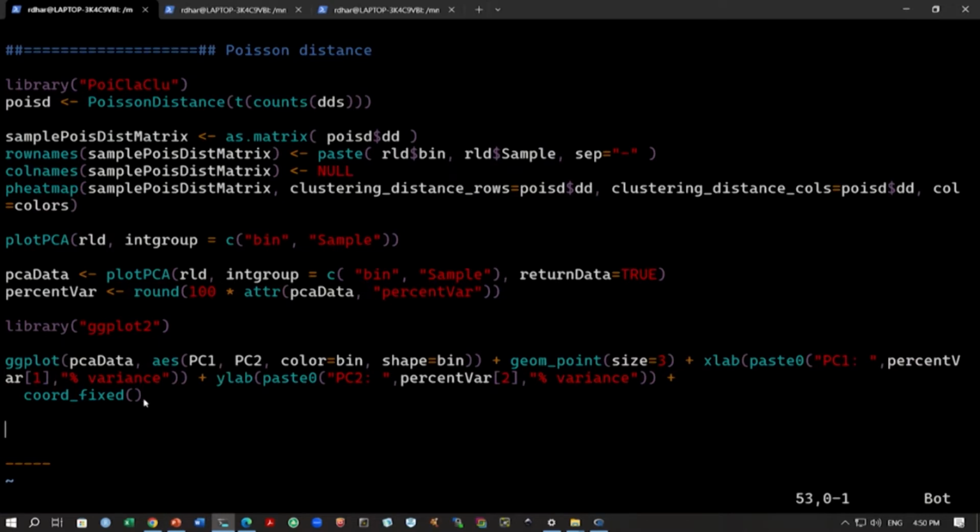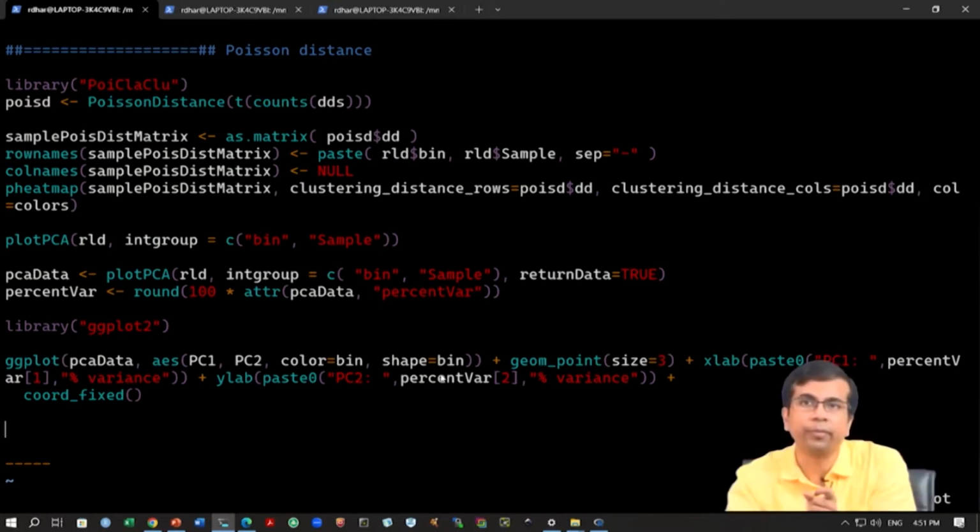If you are not familiar with ggplot, do not worry, you can look up the ggplot2 manual, and you will see how we can specify all these axes, the point size, etc. It's a bit different from what we have used before. For the plot function, we mention inside it xlim equals c something, ylim equals something, the x label, y label, everything inside this plot function. But ggplot is different.